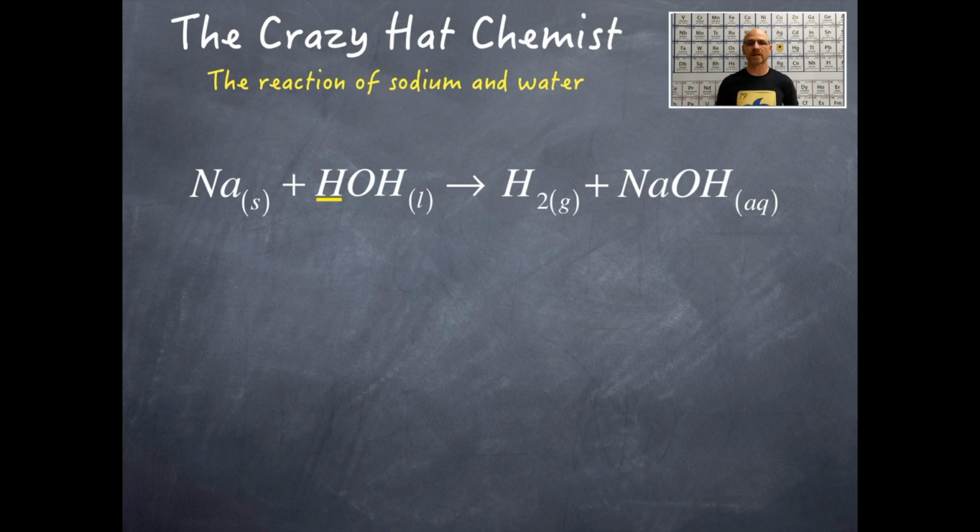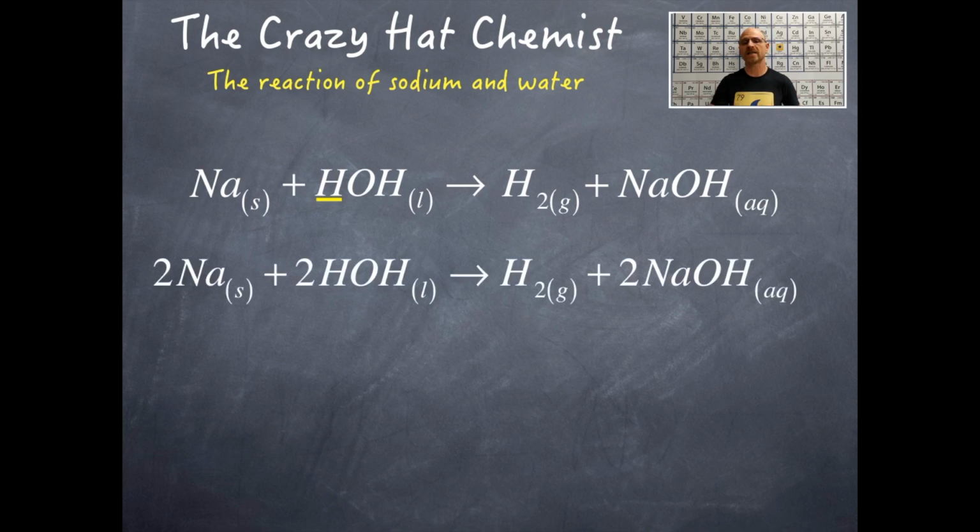Okay, let's get a balanced equation for this too. Okay, so you're going to put a 1/2 in front of that hydrogen gas and then multiply the whole entire equation by 2, and then you get this right here. Now, I've indicated the phenolphthalein right here because the phenolphthalein turns pink in a basic solution, and that's why it is pink in the water layer in the graduated cylinder.